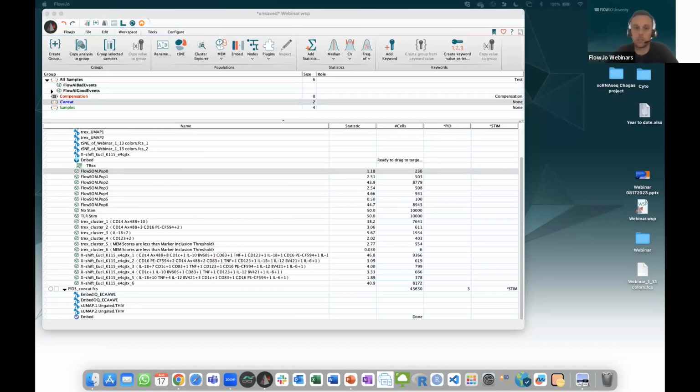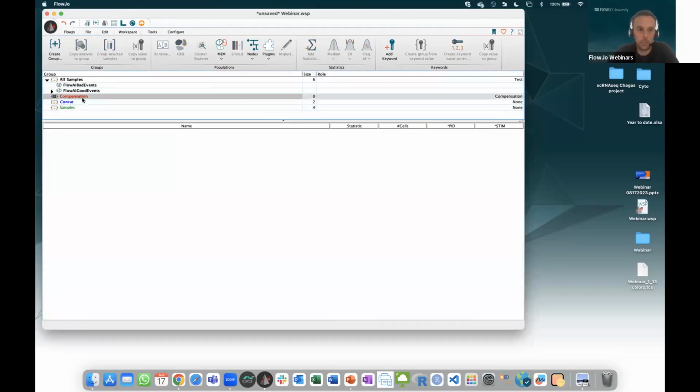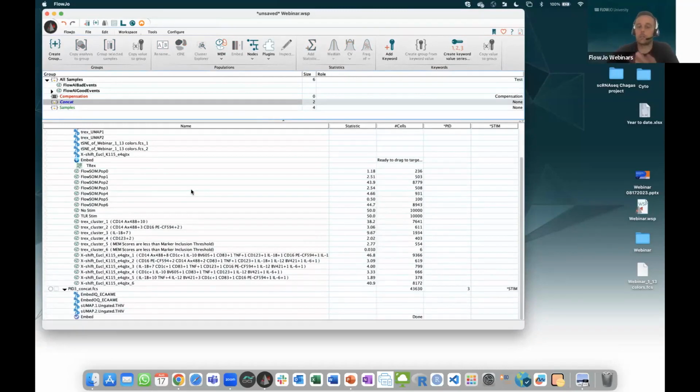You can downsample your samples a lot just to have the map, and run everything on really few cells, like I did today on 20,000. Maybe it's enough to see all your different cell populations, but because you recorded like 50,000 cells for each sample, maybe it's worth running embed on those real samples, because we're just going to try to map everything and make sure you didn't miss a really rare population. That can be one way to do it.